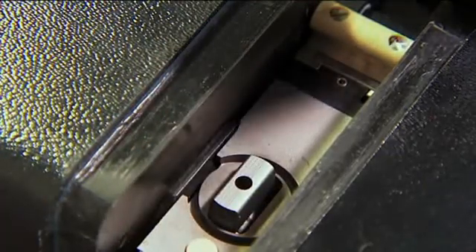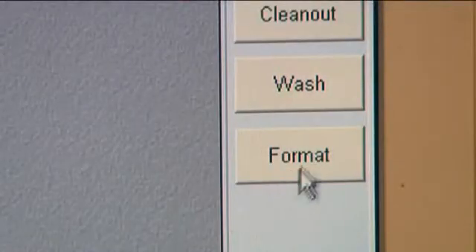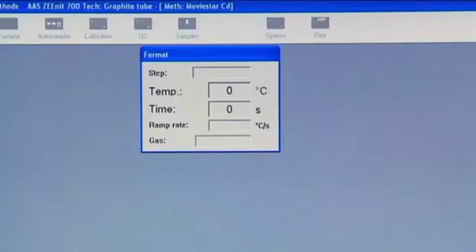Before a measurement series is started and while the furnace is being exchanged, the temperature of the graphite furnace is measured and corrected during a forming routine. By these means, reproducible atomizing conditions are ensured over the whole service life of the furnace.